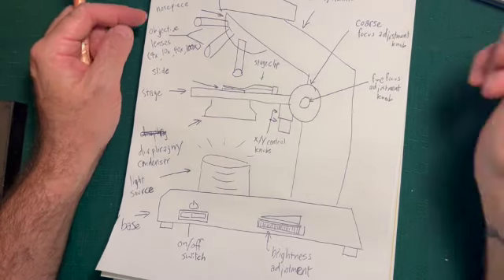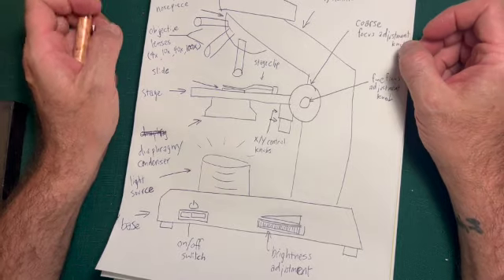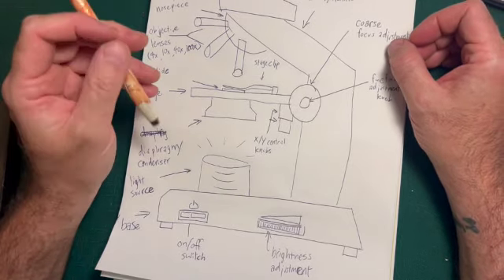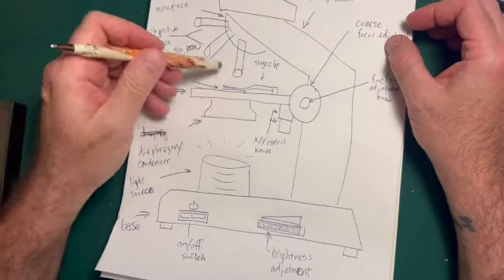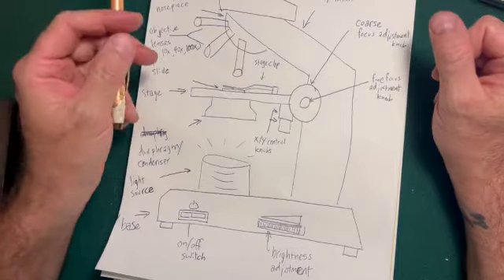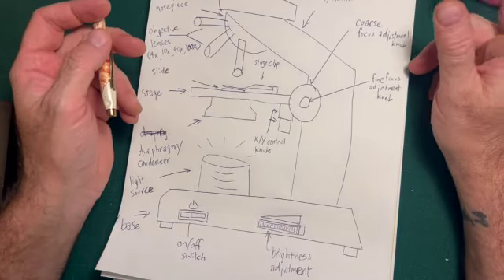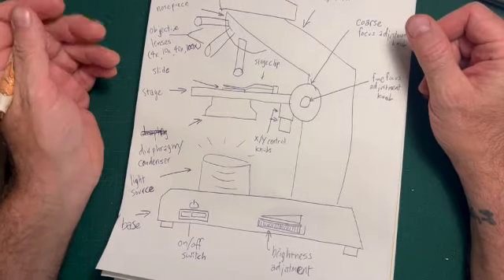It is not healthy to stare into bright lights as is not necessary. But also at lower magnification, you need less light to be able to see your specimen with the amount of contrast necessary to detect and resolve what you're seeing.